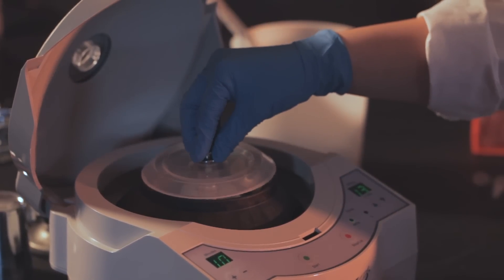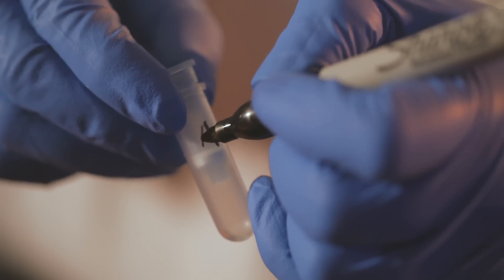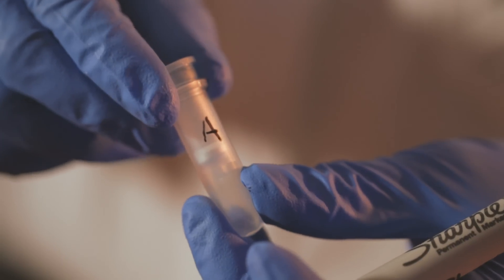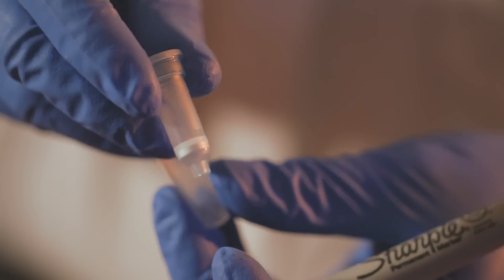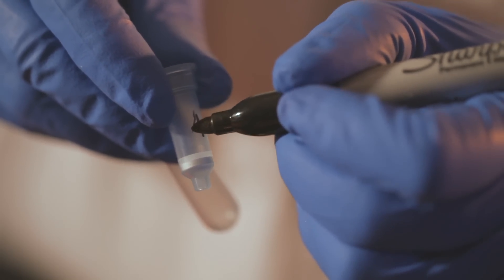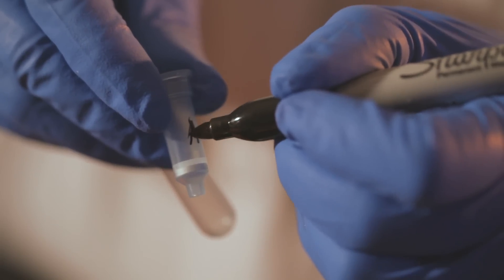While your samples are centrifuging, label one spin column for each culture you started with. Each spin column consists of the column set inside an empty collecting tube. Label both the collecting tube and the spin column.